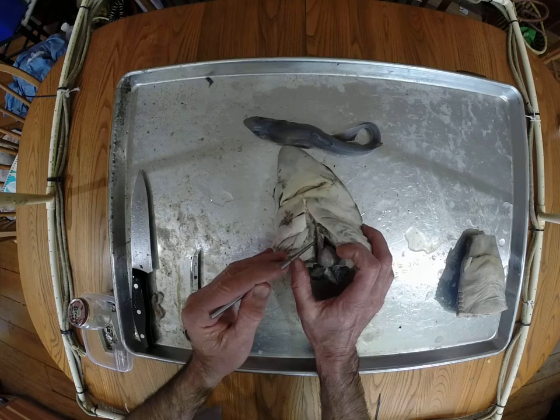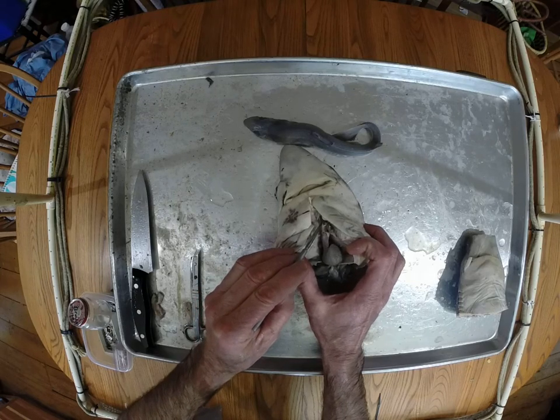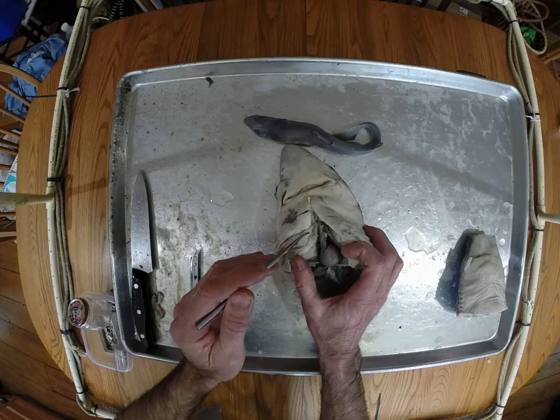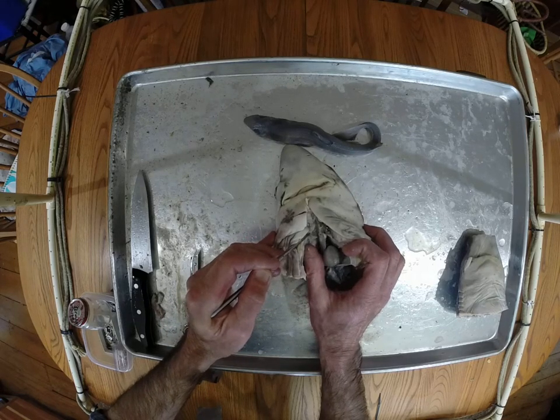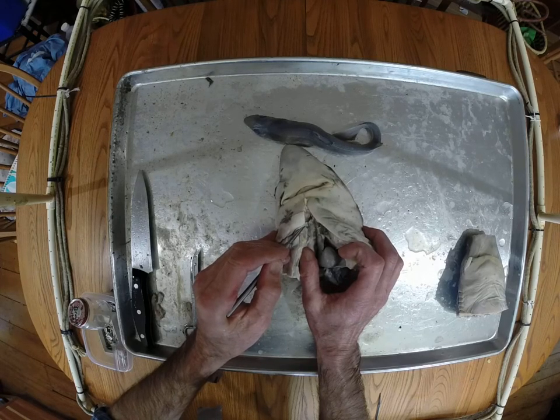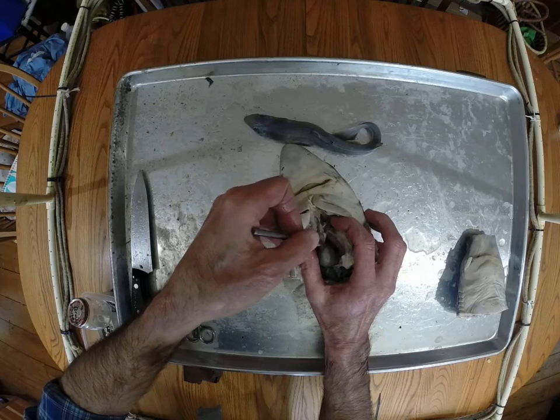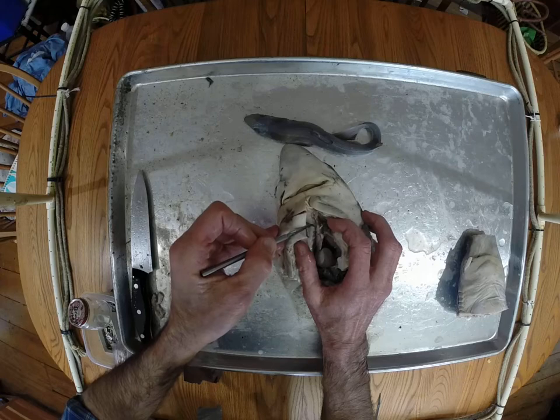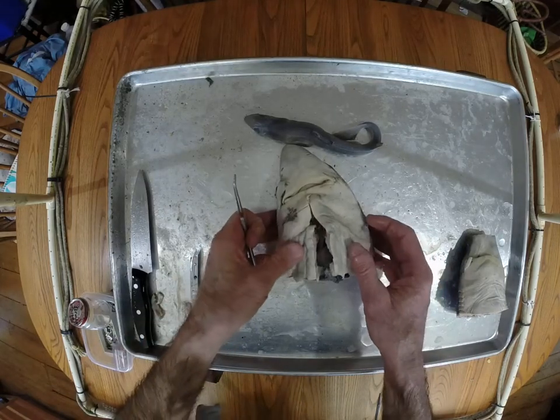and essentially it evens out the blood pressure in the fish. From the conus arteriosus, then we go into the ventral aorta here, and we can see right there where the ventral aorta is branching, and there are some other branches that have come off here. So essentially one branch to each gill arch on each side of the fish, and these are the afferent branchial arteries. So you can see one there, you can see one there, must be one down there somewhere, and you can see that one, this branch right at the anterior-most end. I hope we can see that here. So just to review then, atrium's down here, the ventricle, the conus arteriosus, the ventral aorta, which is branching into the afferent branchial arteries. Okay, so that's part of the branchial circulation.